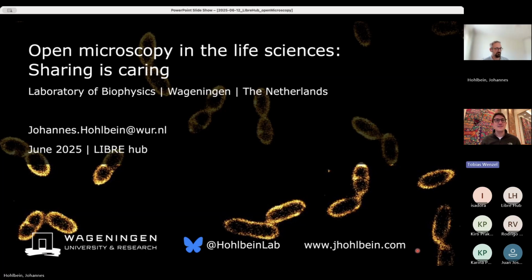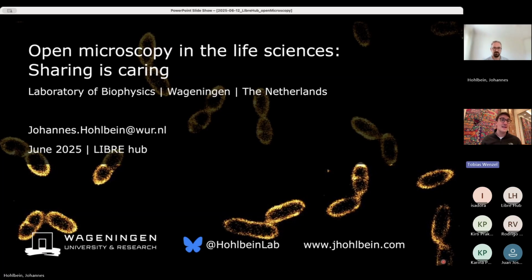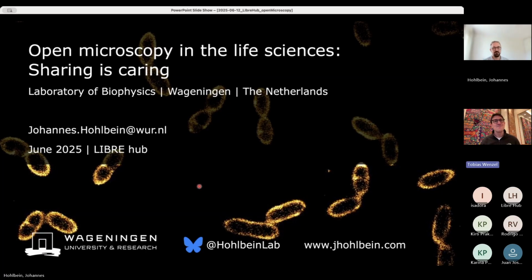This is the LIBREhub seminar series. We're talking about open source technology for bioimaging. But we talk about open source usually in quite a broad spectrum, open hardware especially, open instrumentation. And of course, open microscopy is an important focus in it. And the open microscopy movement has been a little bit parallel to the general open source hardware movement.